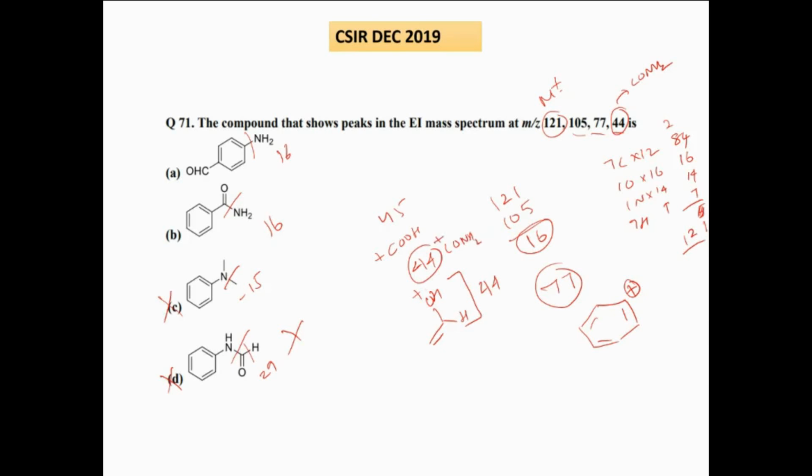சோ சப்போஸ் நான் இந்த மாலிகுல் இங்க உடைச்சேனா, ஆல்டிஹைட் 29 plus 16 is 45 வெளியே போயிடும், பட் நம்ம கொடுத்திருக்கிறது 44 தான். And CHO, NH2 ரெண்டுமே வெளியே போச்சுனா, எனக்கு மிச்சம் இருக்கிறது 76 தான் இருக்கும். So but I need 77, so இது rule out. A ruled out. So minus 16, so இது என்ன ஃபார்ம் பண்ணும்? So first you will be having formation of the molecular ion peak.